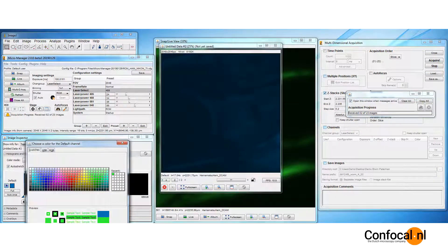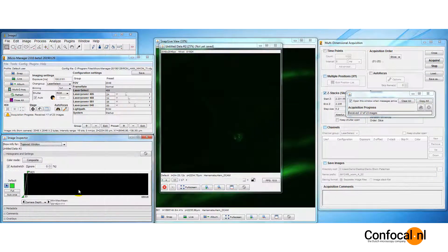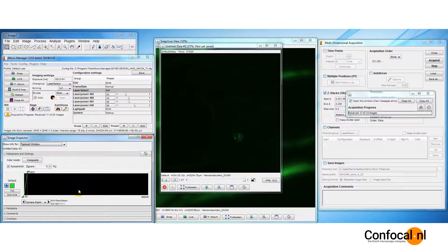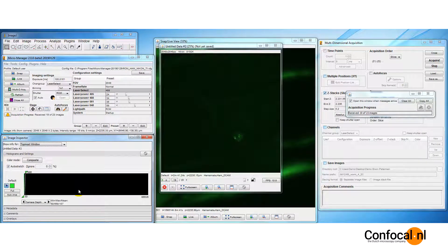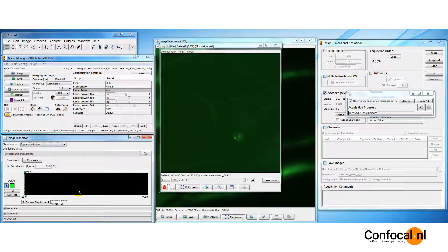In the relative z mode, depending on where you have focused the sample, enter the travel range for the upper and lower limits of the volume.